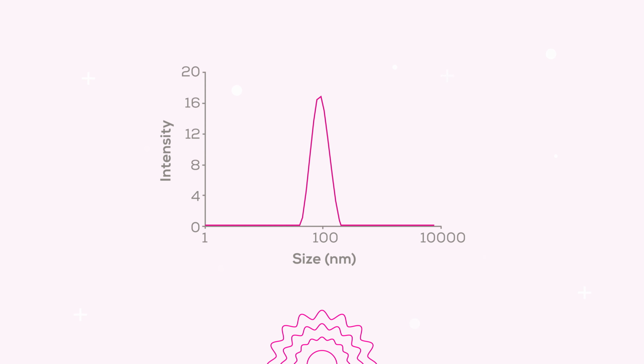Here we have external data illustrating the size distribution of mRNA-loaded LNPs, as assessed by DLS. On the surface, it appears to showcase a fairly normal distribution with a low polydispersity index, indicating a seemingly clean dataset. This ultra-smooth appearance is a characteristic trait of DLS, as it is an ensemble method, meaning it doesn't provide independent data points for each individual particle in your sample. Consequently, the output is an overly smooth curve, giving the data a polished, almost artificial look. But does this reflect the reality of the sample?